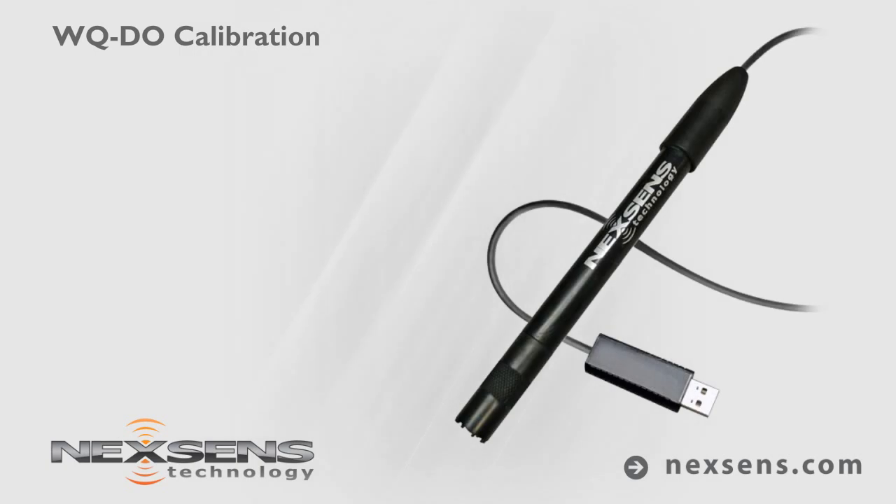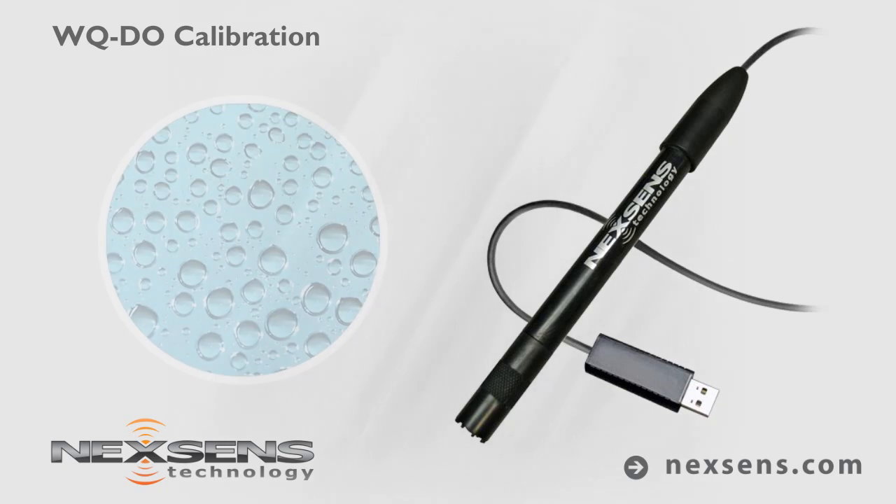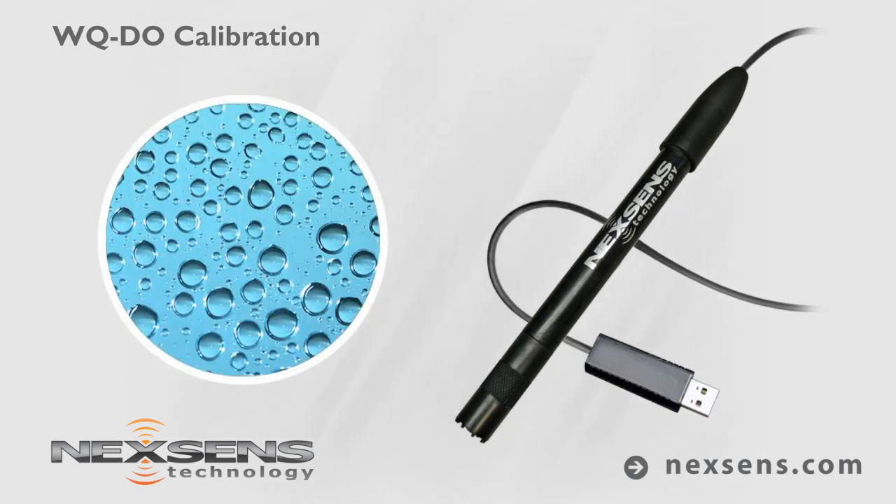Calibration and measurements with the NexSense WQ Dissolved Oxygen Sensor are easy and reliable. The software supports a one-point calibration, which is typically performed near air saturation. However, a milligrams per liter calibration can be performed at any concentration.